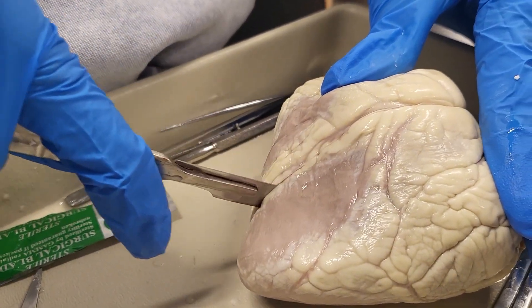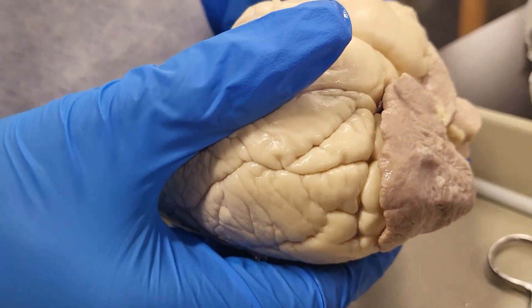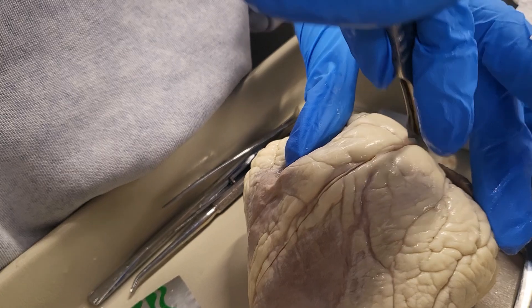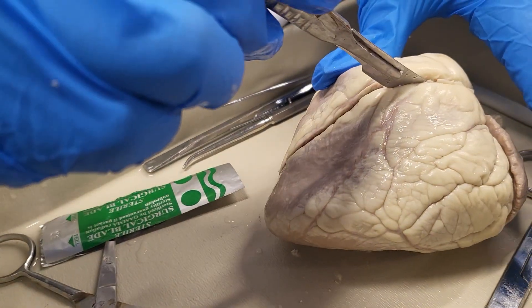Then we went ahead and sliced into the heart.